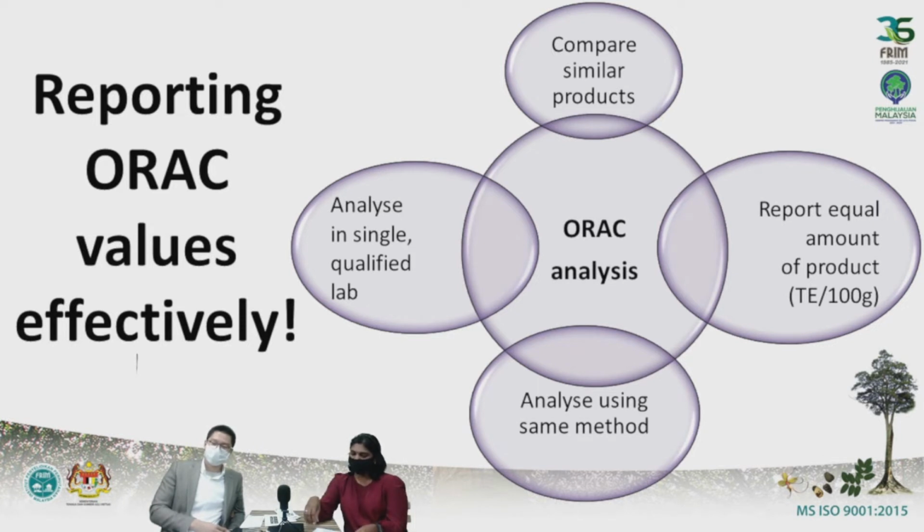Okay, so when you say analyzing using the same method, that means it must be the exact same protocol. Yes, exact same protocol. And if we are talking about a single qualified lab, it means if you send to lab A, then if you want to compare, make sure you send to the same lab A again. Because we are not sure whether lab A or lab B might be using a slightly different or modified protocol. Oh, all right.